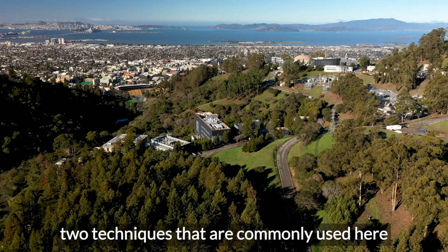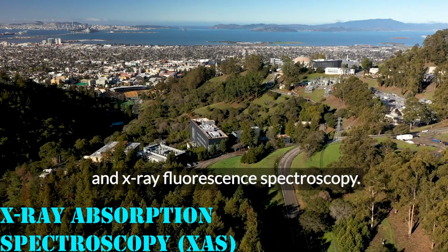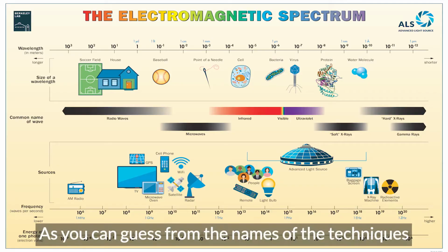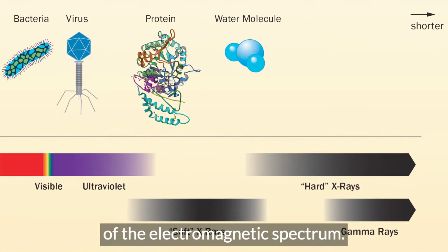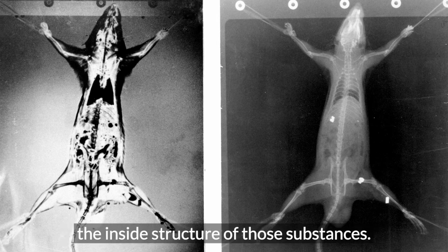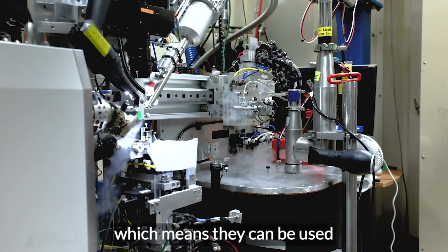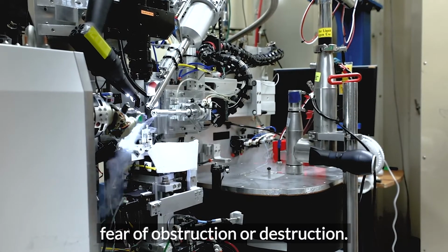For instance, two techniques that are commonly used here are X-ray absorption spectroscopy and X-ray fluorescence spectroscopy. As you can guess from the names of the techniques, they really focus on the X-ray portion of the electromagnetic spectrum. X-rays are useful for penetrating substances' surfaces without harming them, which makes them useful for understanding the inside structure of those substances. This is because X-ray light is invisible and non-destructive, which means they can be used to peer into substances without fear of obstruction or destruction.